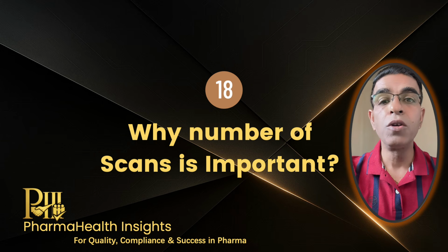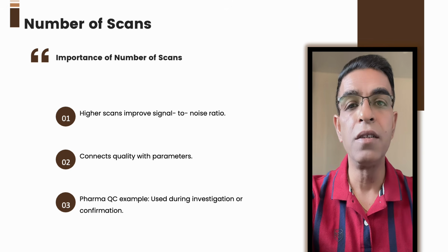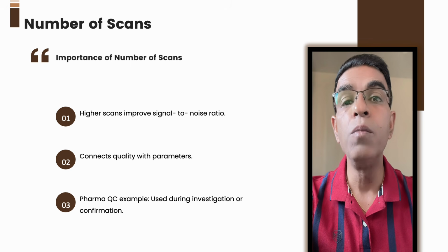Now, you may be asked about the scan numbers. Why is the number of scans so important in an FTIR analysis? And you can answer very naturally like this. Sir, the number of scans improves the signal to noise ratio. So the more scans we take, the spectrum becomes clearer and the peaks are more reliable.